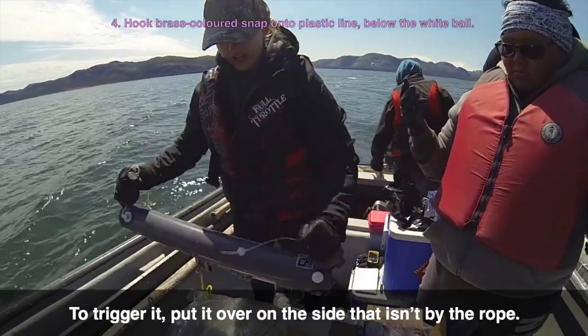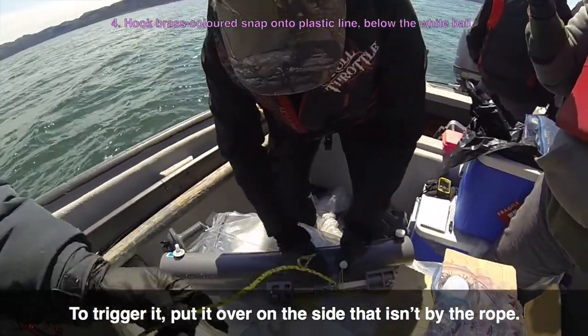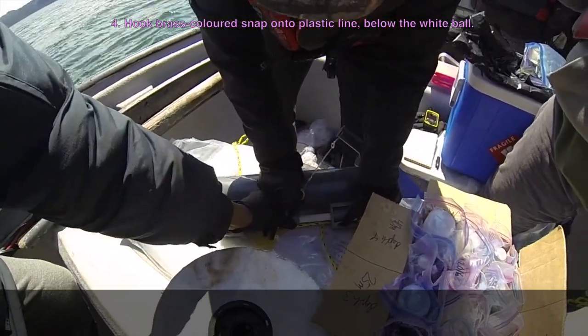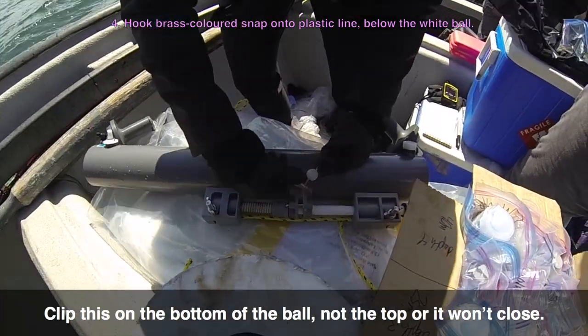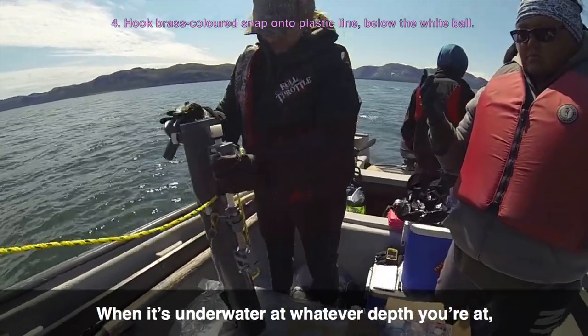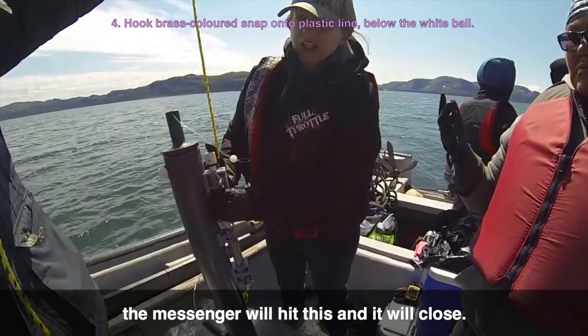So to trigger it, put it over on the side that isn't by the rope. Push that down, clip this in the bottom of the ball — not the top or it won't close. So when it's underwater at whatever depth you're at, the messenger will hit this and it will close.